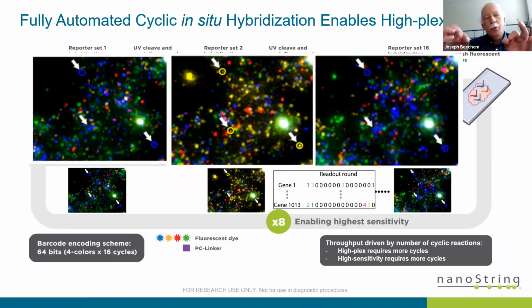And so one of the key things is when you're doing imaging reagents, that's why we do no amplification on our imaging reagents, okay? So they're the smallest possible bright spots. So that's one reason that they're packed, roughly 30 dyes get packed into a 20 nanometer barcode. So making them small is good. That means the crowding happens later. You can crowd them in there a whole bunch, and I'll show you how many you can see at a time. But then the other way to control the crowding term is that I can control the series of sequences.